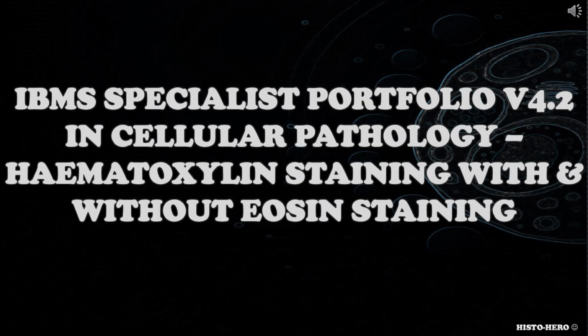And today's video will be about hematoxylin staining with and without EOSIN staining, which is part of the IBMS specialist portfolio in cellular pathology.